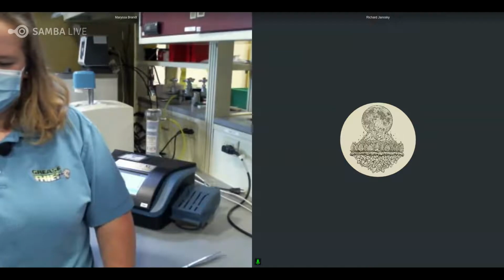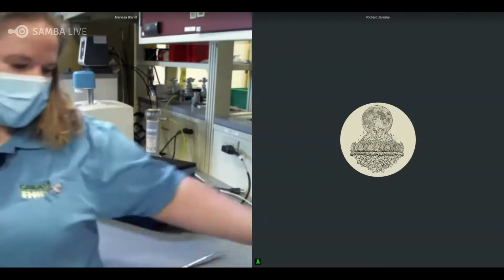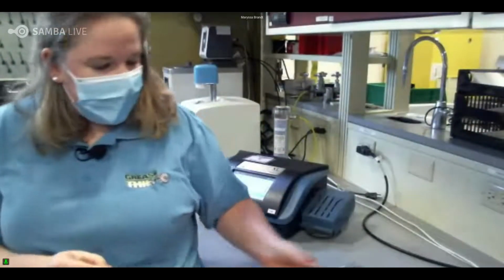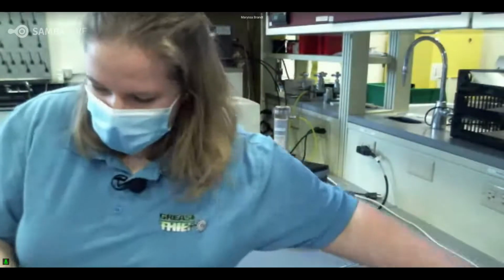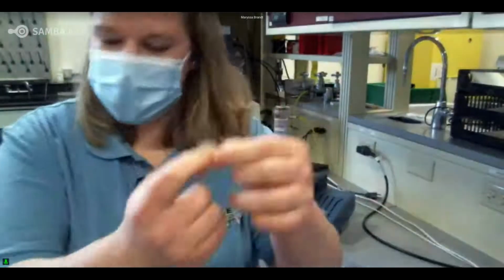Yes, Marissa. If you could just explain or talk a little bit about the septums that you already mentioned and how, if they can be reused or not in the vials. Great question, Richard. Yes, so the septums can be reused. You do not have to buy new septums every time. The septums just put a little hole at the top where the needle goes in.